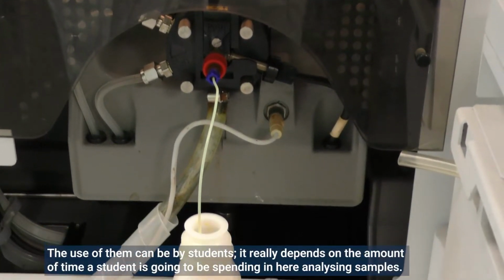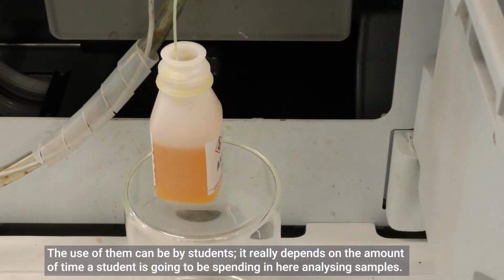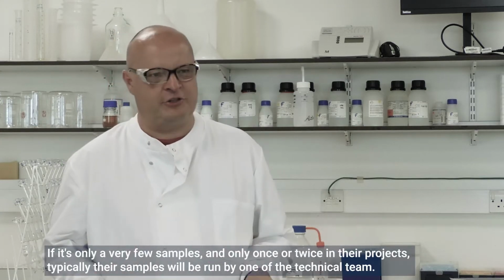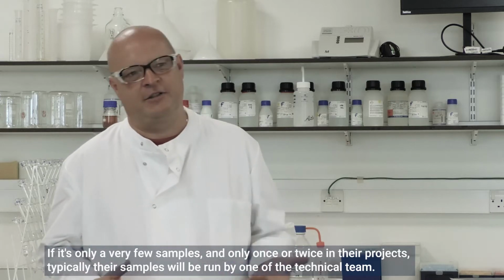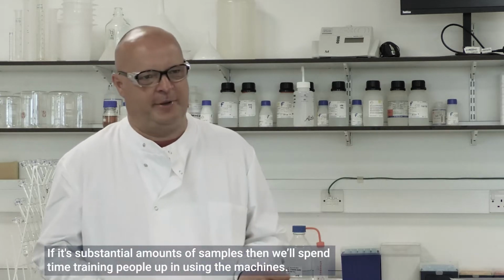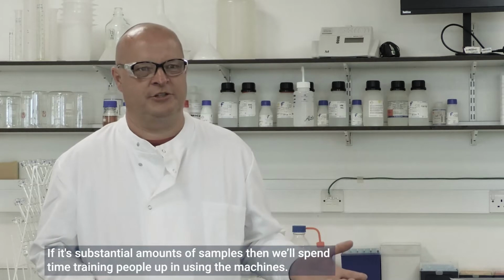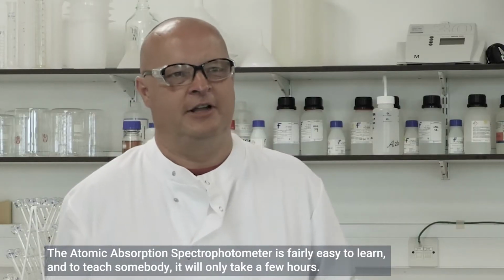The use of them can be by students. It really depends on the amount of time a student is going to be spending in here analysing samples. If it's only a very few samples and only once or twice in their project, typically they'll be run by one of the technical team. If it's substantial amounts of samples, then we'll spend time training people up in using the machines. Atomic absorption spectrophotometer is fairly easy to learn and to teach somebody.